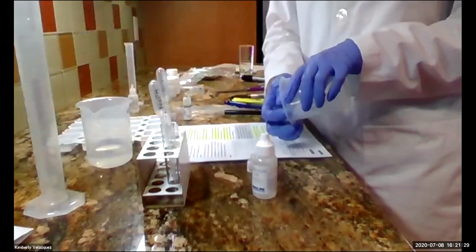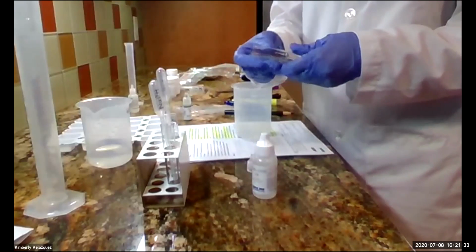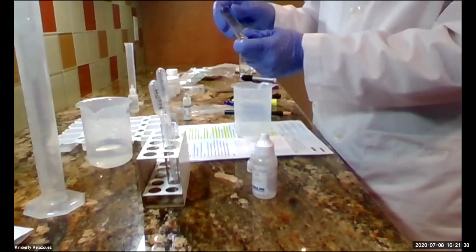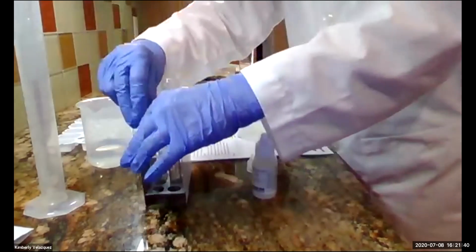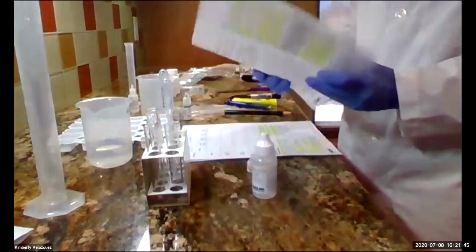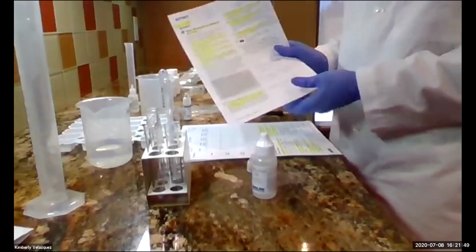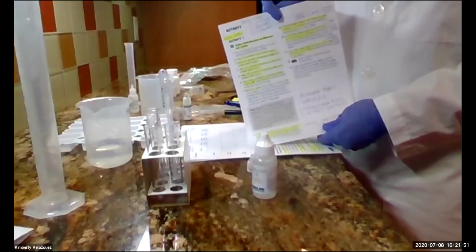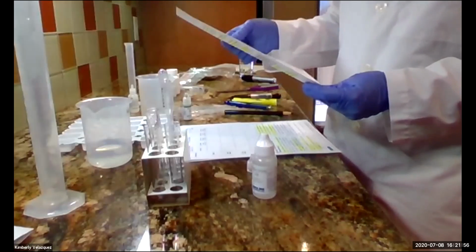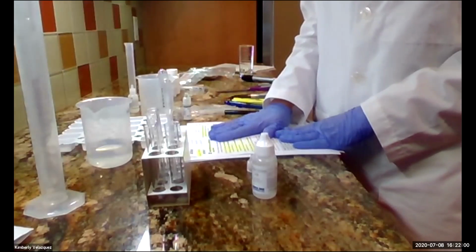I've been keeping these in the beaker, and I've got them labeled 50%, 25%, and 12.5%. Now those are going to go in my test tube rack, and I'm going to follow the instructions for activity 2. Now that you've done activity 1, activity 2 is not as difficult, but just really follow step by step, highlight and think about what you're doing, take a picture, and in the questions, you'll be analyzing what all of this means.